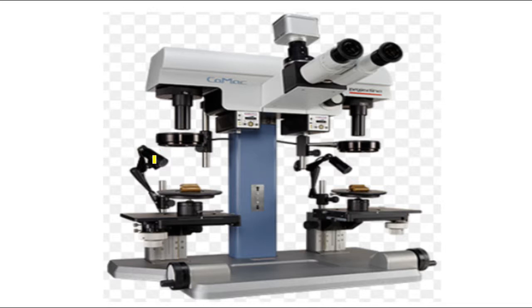Here, by the way, is a light. If you want to shine light on it, you have this light. There's also a little connector over here. This would lead not just to, let's say, something visual. It might be able to give signals to a computer, or to save them as digital pictures. Again, this is a relatively useful and advanced comparison microscope, which is also stereoscopic. In any event, the main point that you should see is how this is a comparison microscope. We have these two stages for the two samples, and it's stereoscopic because you're looking at it through both eyes.